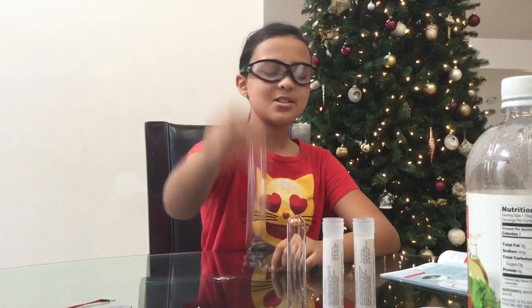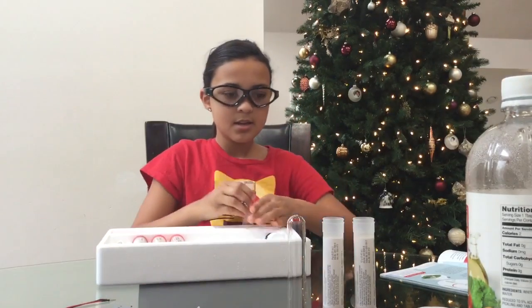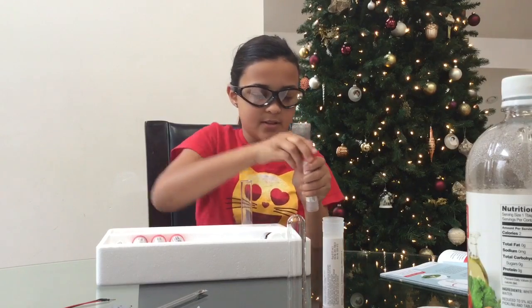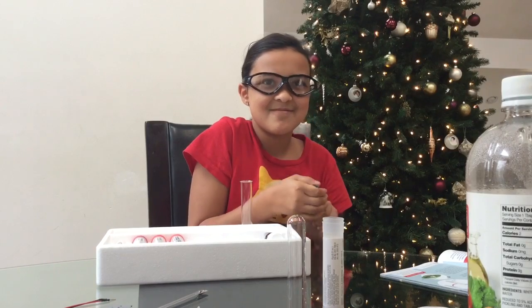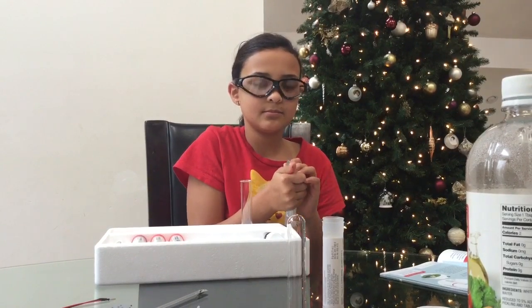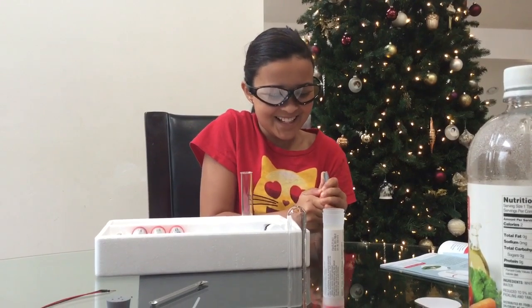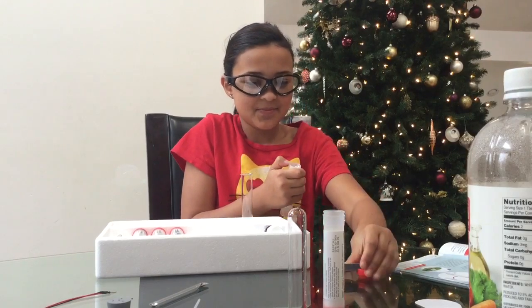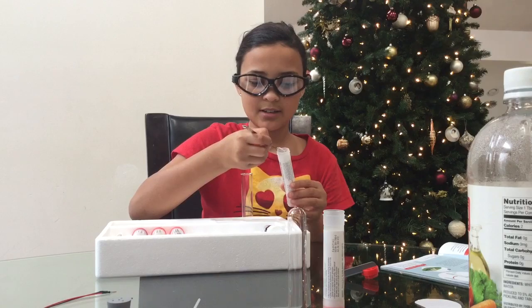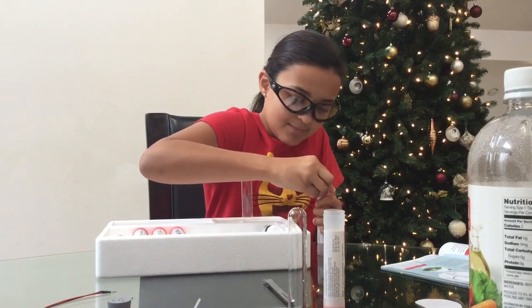You take one dry test tube and you take a large spoonful of sodium carbonate. I'm going to use this to drop it up. Sodium carbonate... And then you take a large spoonful, shake it off, and then you put it into the test tube. And then you close it back up.